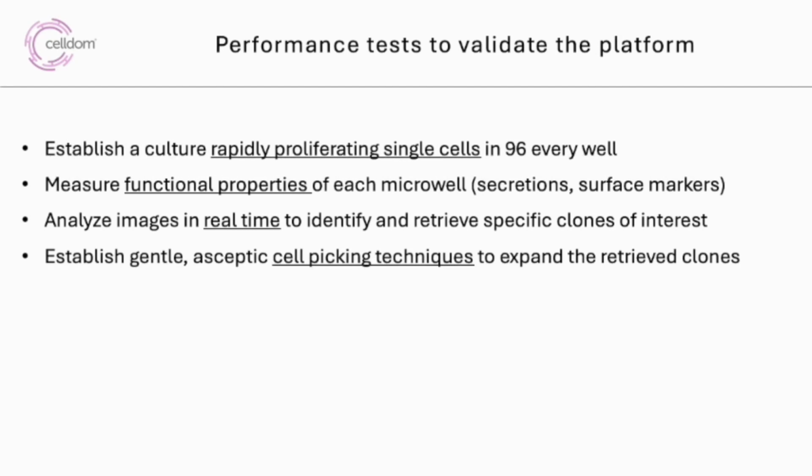We also needed to validate that our picking method did not damage the cells and therefore affect their viability, and also that picking did not introduce contamination, either between adjacent picks or other sorts of contamination.